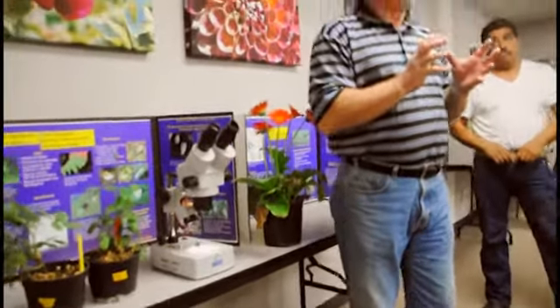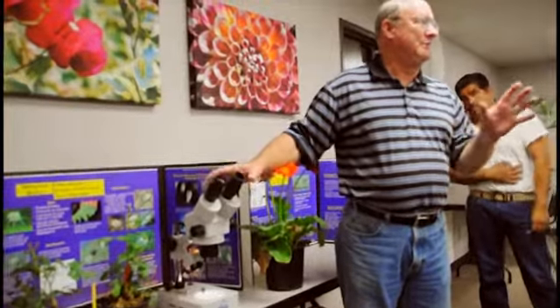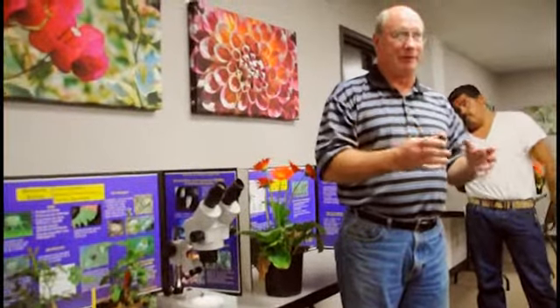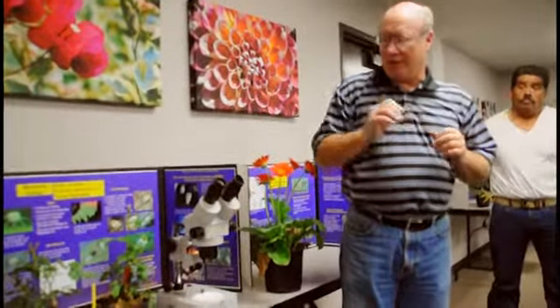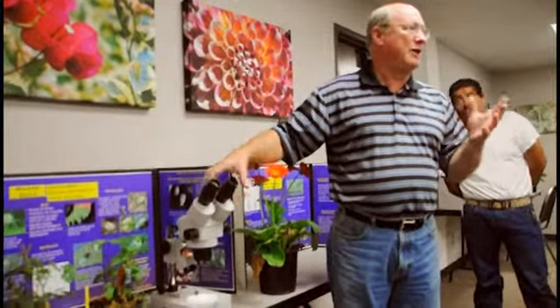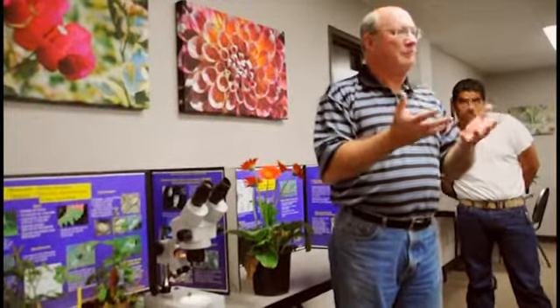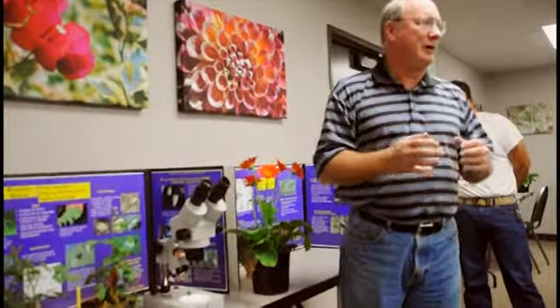What's really important is that this is going to be your best friend in ornamental plant production. If you can get a microscope, or get your managers to get a microscope, that's really, really important. And to be able to use it is also important. So you have to know the parts and know how to use it, so that you're not confused, or that it doesn't make you upset that you've got to work real hard to figure out what's going on.